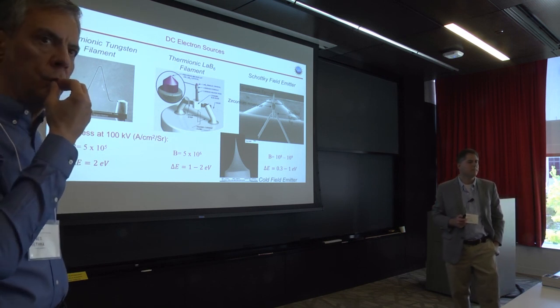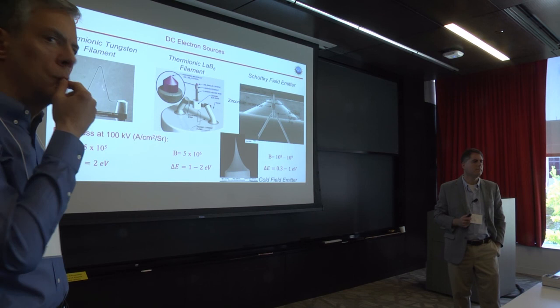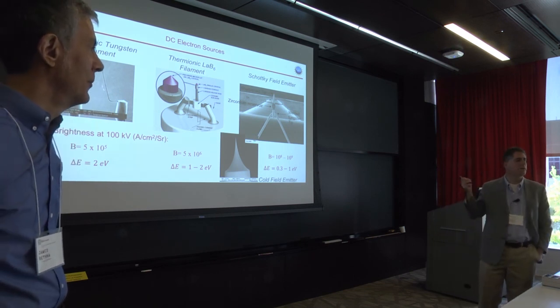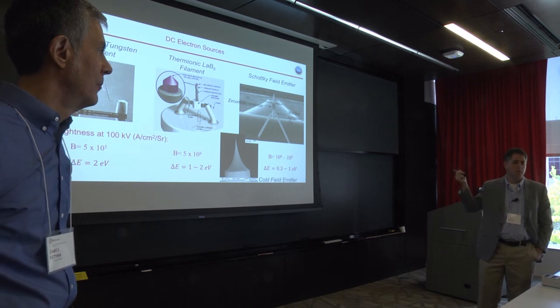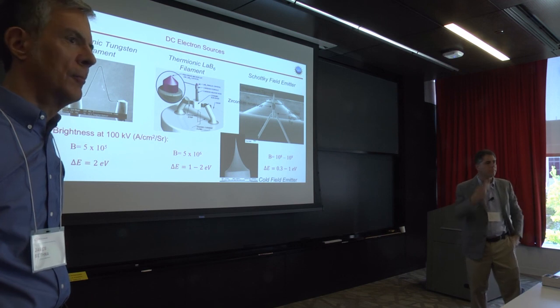If the microscope can survive with samples being in a very strong magnetic field, then I know how to suppress the energy spread. We should talk, because most of our other lenses are usually a 2 Tesla field anyhow.